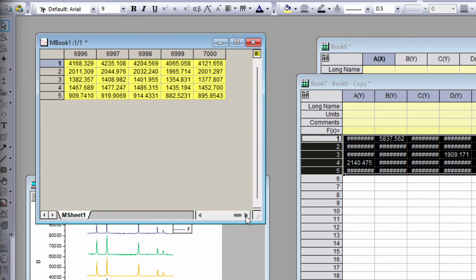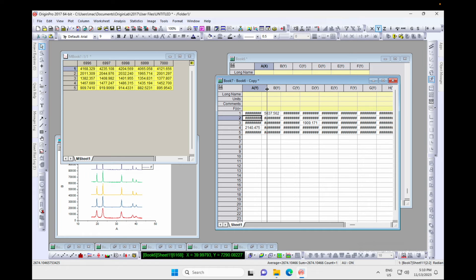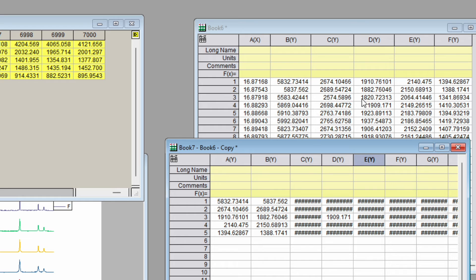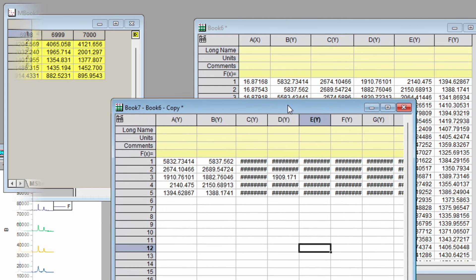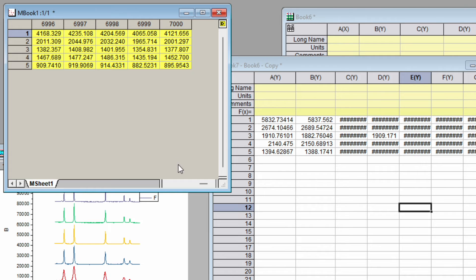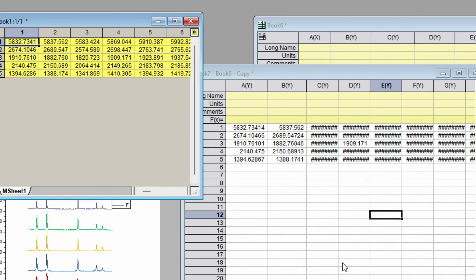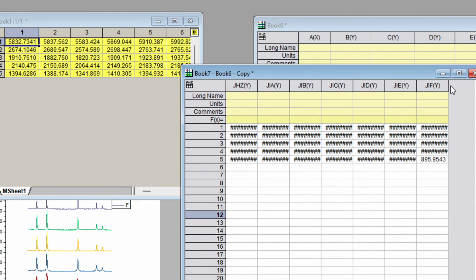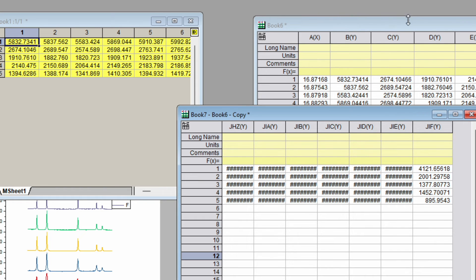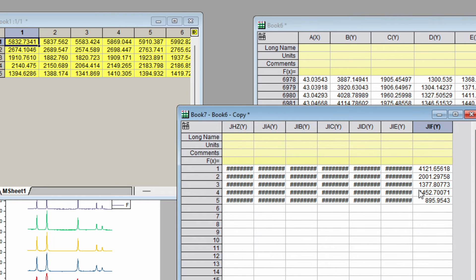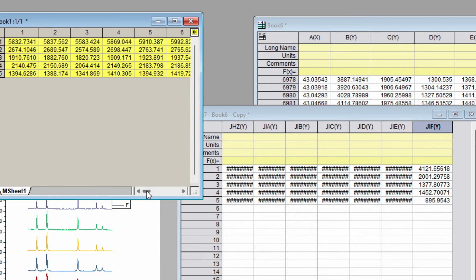Go back to the matrix and paste the data. Double-check the numbers: 16.87 is the first 2-theta value. For the five different temperature values, you should see five distinct intensity values — 5826, 1921, 1394, 2140, and so on. Verify that the values at the last column match those in the worksheet. The numbers should be the same, confirming a correct paste.